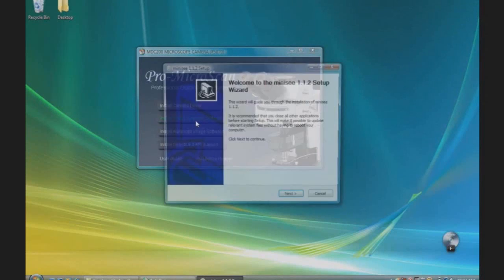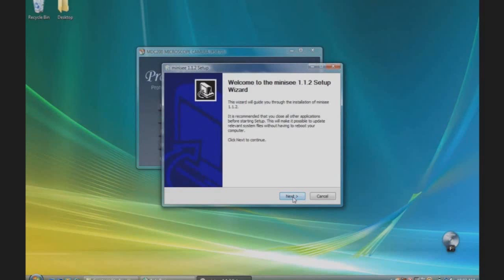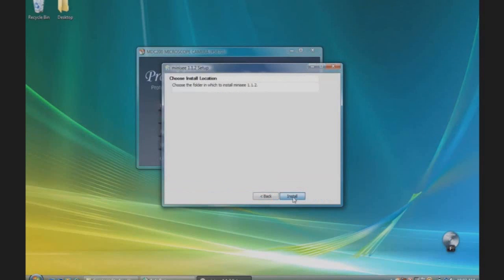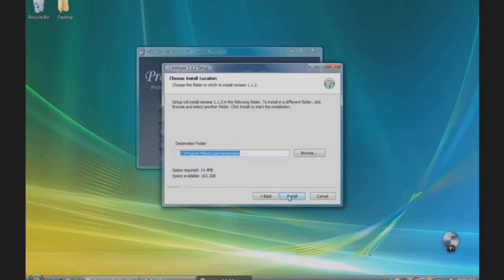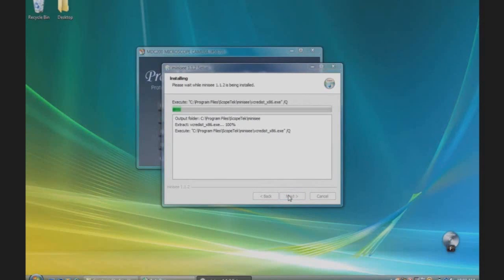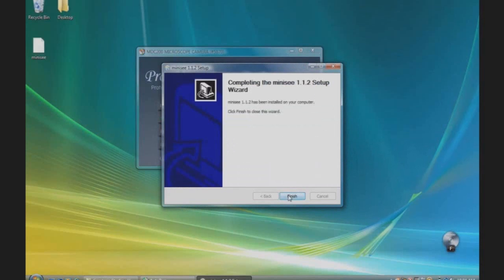The Mini-C Setup Wizard will appear. Click Next. You can choose the destination folder. In this case, we will use Default. Click Install. When the installation is complete, click Finish.